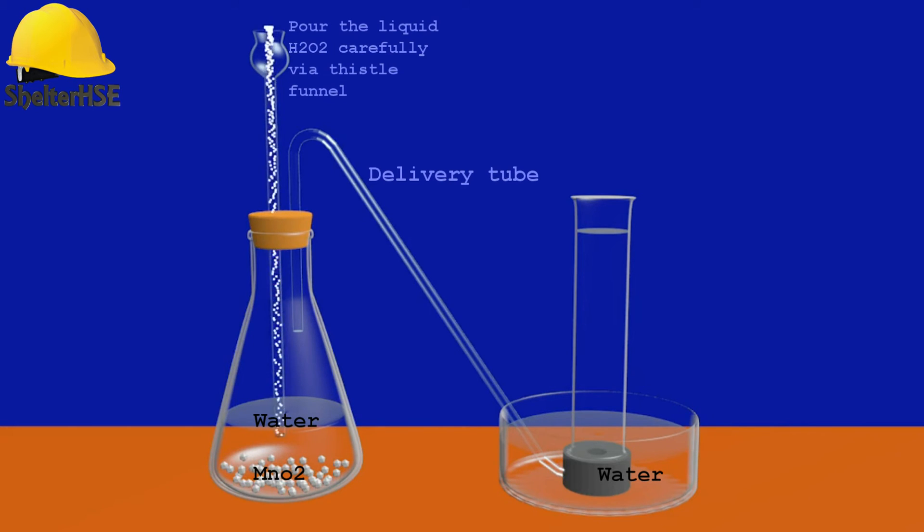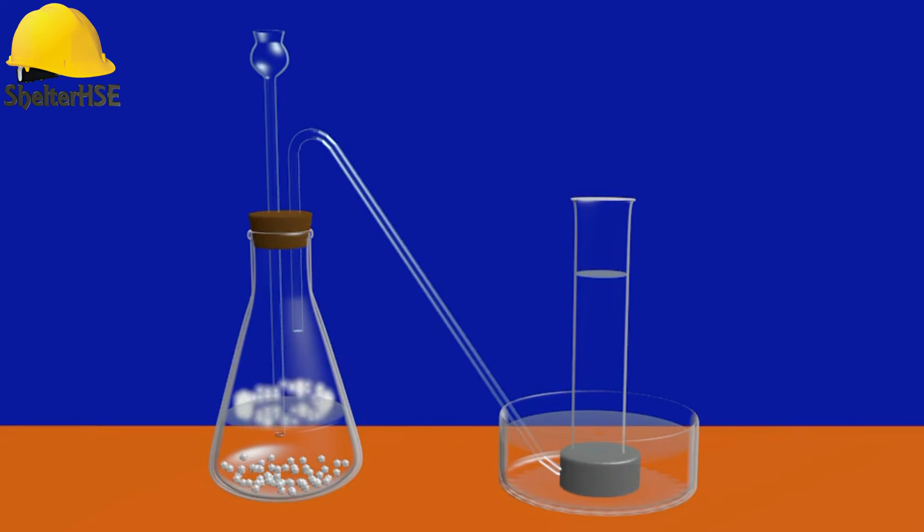Mixing hydrogen peroxide with water in the presence of manganese dioxide will start the reaction. The reaction will make the gas evolve in the conical flask. Evolved gas will find a way through the delivery tube and start accumulating in the jar against the displacement of water.